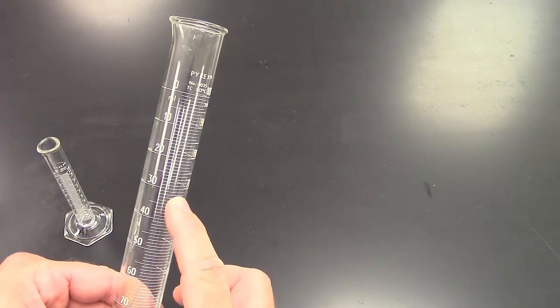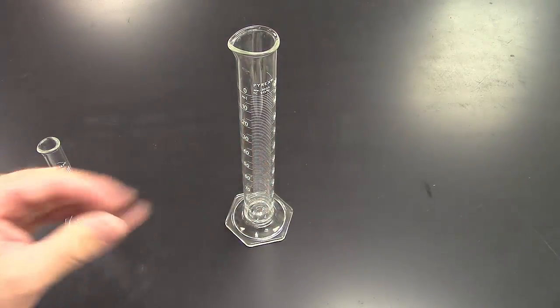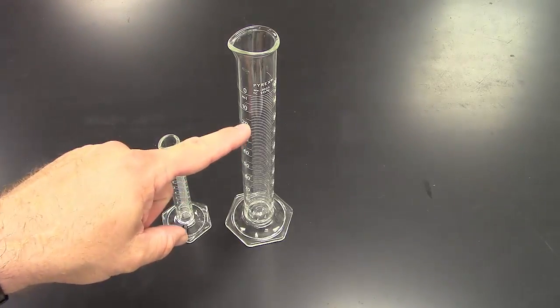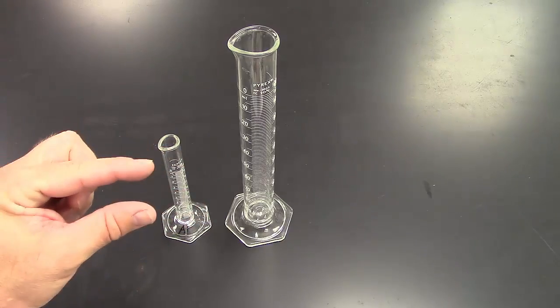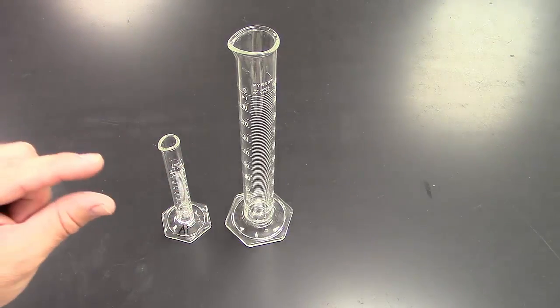Now, if you need it up to 100, then you use a graduated cylinder. Actually, in the back, I have different graduated cylinders. If you need to do more than 100, then I can give you a larger one. It will have smaller lines, so remember, always check what is the smallest increment found on any device. And then you can estimate for significant digits to 1/10 of that smallest increment.